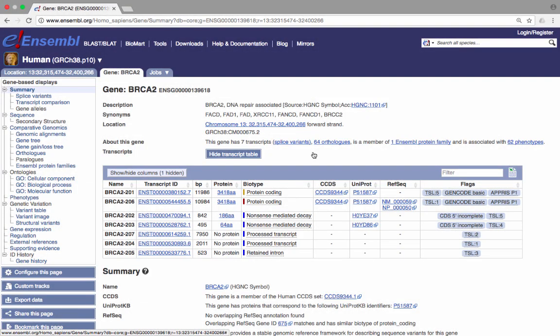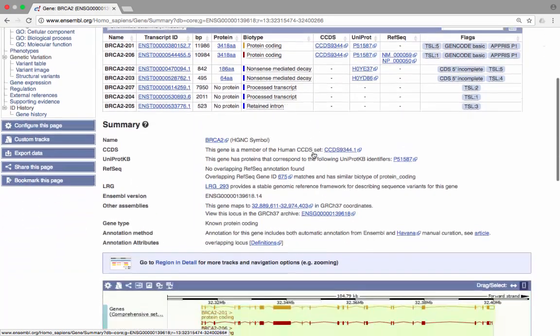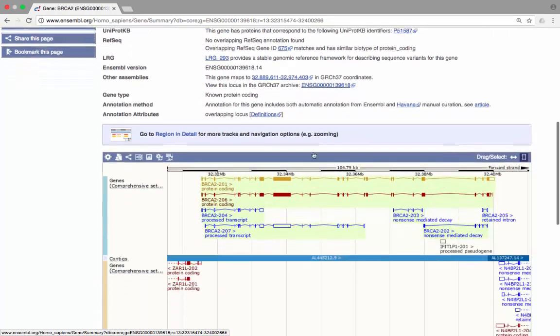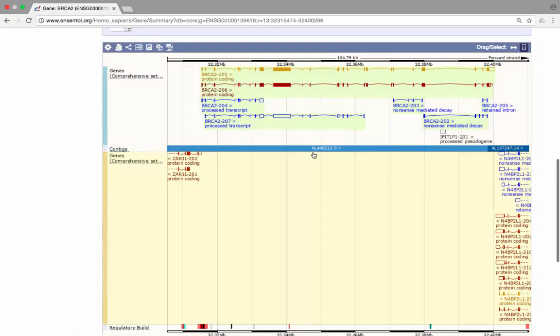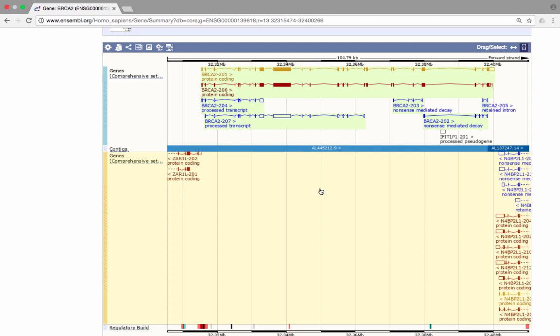Further down this page, we can see the transcript models. The contig, representing the genomic sequence, is displayed as a blue bar. Transcripts above the contig are on the forward strand. Transcripts below the contig are on the reverse strand. Boxes represent exons, and lines connecting those boxes are the introns. Boxes are filled in if they contain coding sequence. Unfilled boxes represent untranslated regions. The two protein coding transcripts of the BRCA2 gene show coding sequence and are on the forward strand of the genome, above the blue bar.